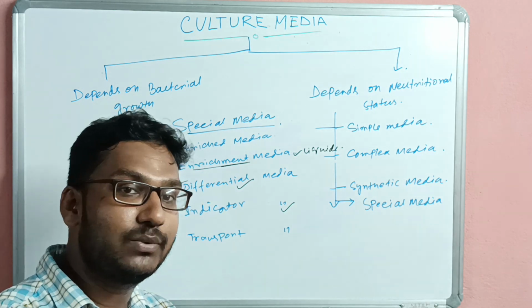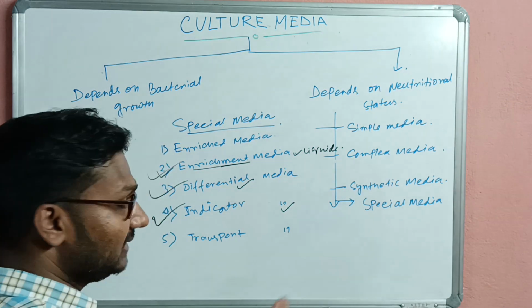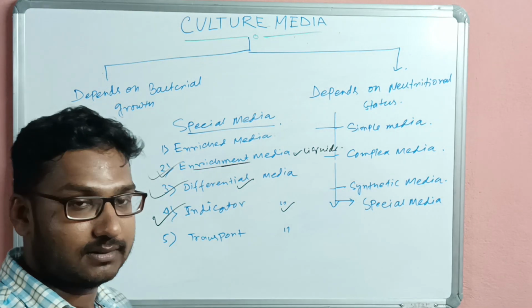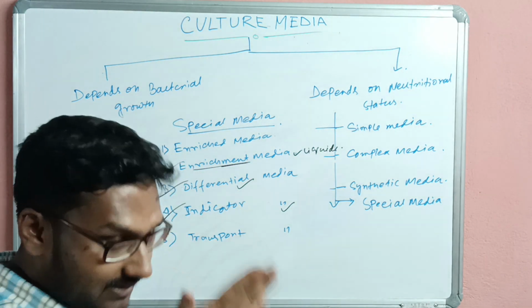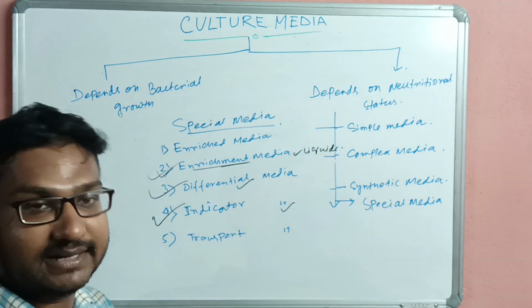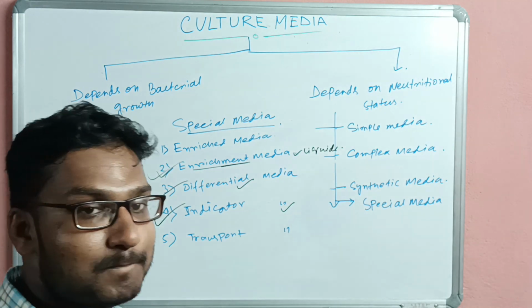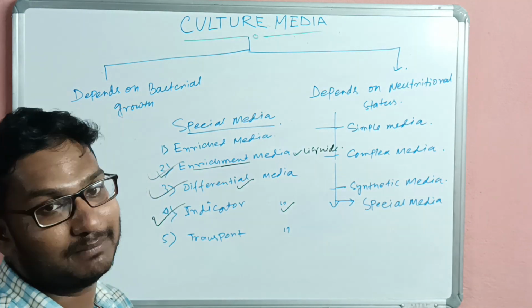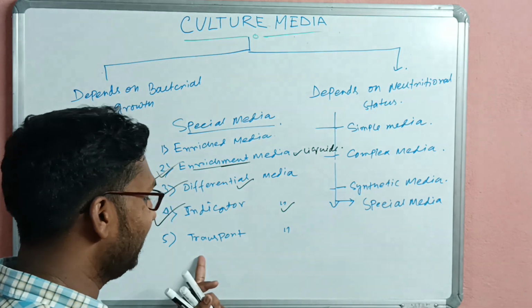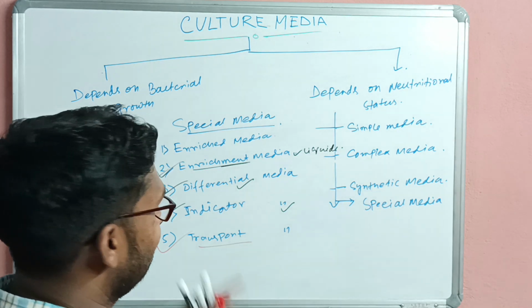It should be liquid in nature. Maximum are liquid, and 2 or 3 transport media are solid in nature. So this is the main function of the transport media.